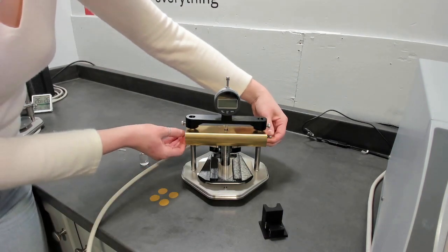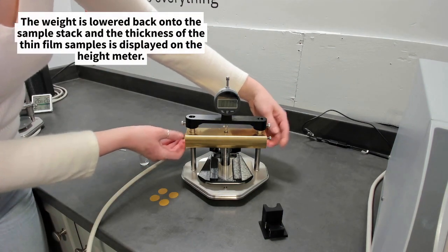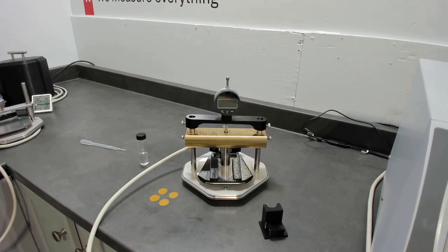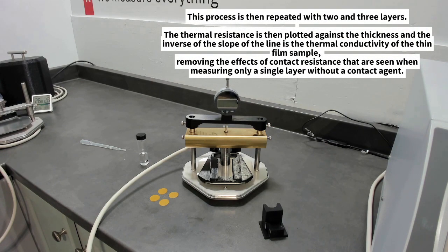The change in resistance with thickness allows us to draw a line through and calculate out the added resistance of each layer and ethylene glycol. We'll repeat this process for two layers and then three layers, and that will give us the slope. The inverse of the slope gives us the thermal conductivity, removing the effects of contact resistance.